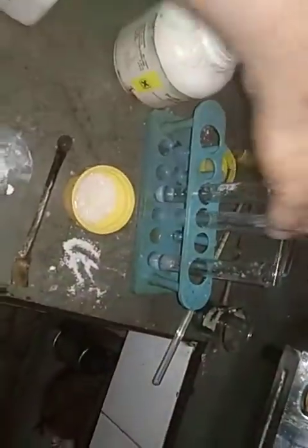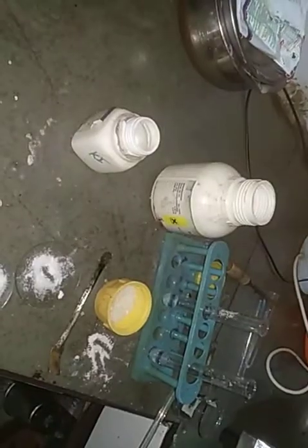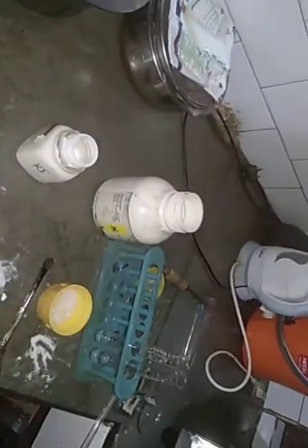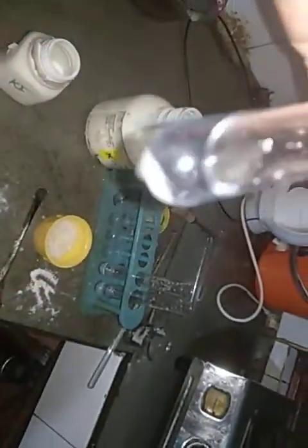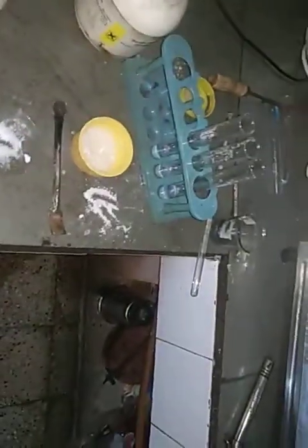In the same way we can look into another test tube, where the crystals have not been dissolving at all. You can see that the crystals are lying and they are available as usual. They do not dissolve into the kerosene. You can see it here even in this case. The crystals are lying at the bottom and have not been dissolving at all in kerosene. So this is how, my dear students, we come to know about the solubility in kerosene.